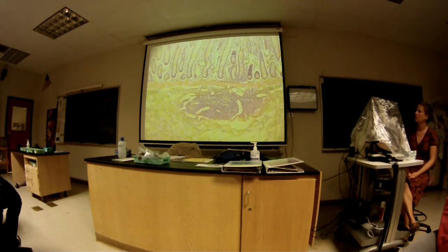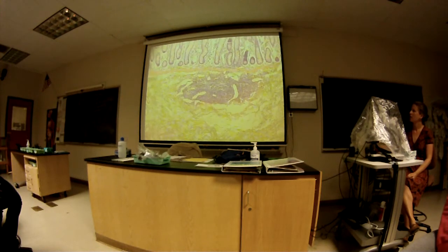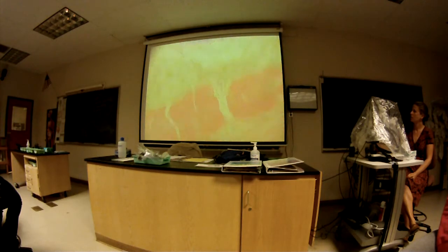Is it always near the top of the submucosal layer? I don't know. Usually, I guess. Sometimes it even goes up into the mucosa. That's what I was saying in lecture. In our slides, the lymphoid nodules have typically been in the submucosa, but they can extend up this way too. Okay. Anything else with the colon?